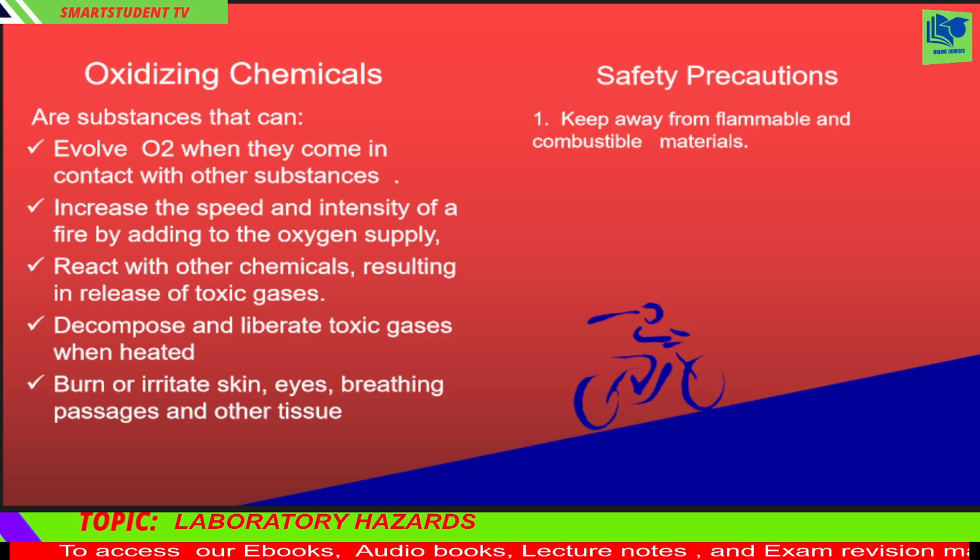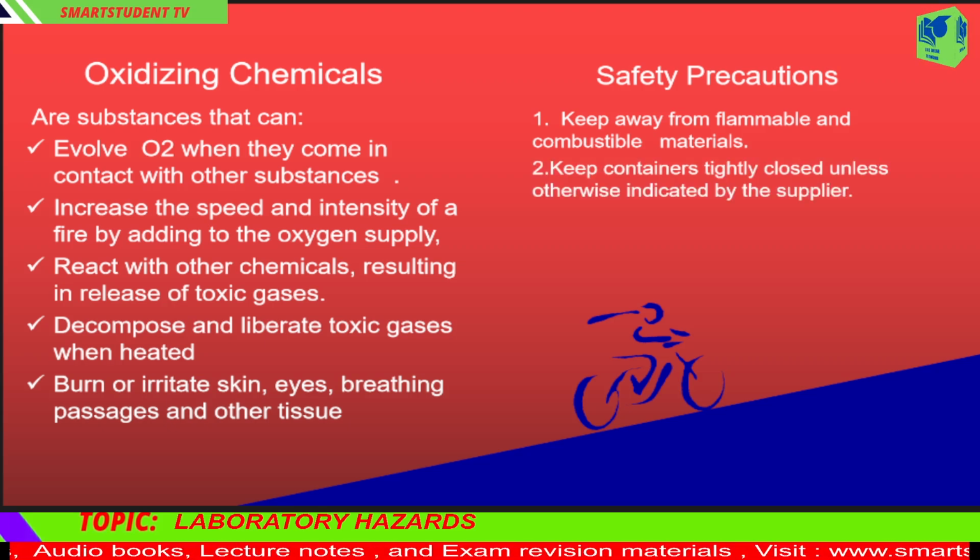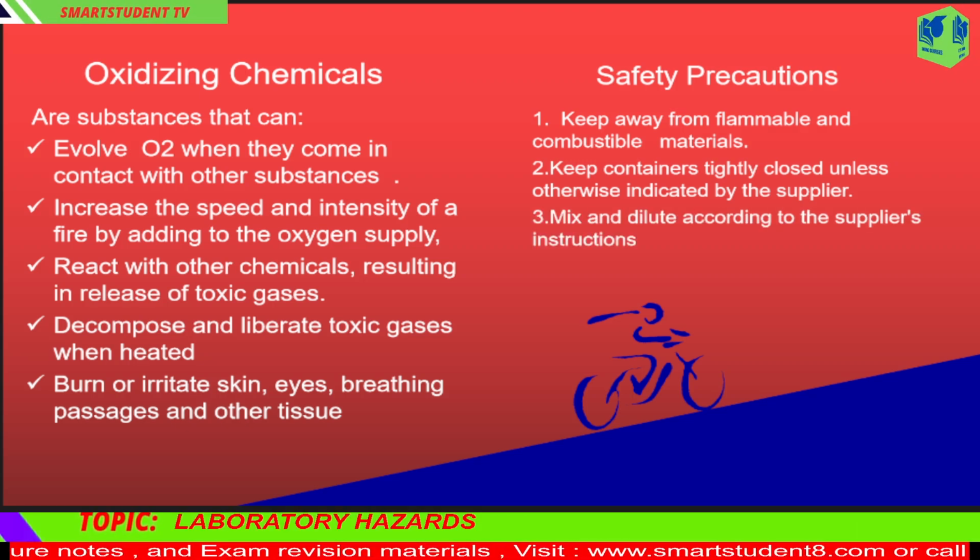Precautions when using and storing oxidizers include: 1. Keep away from flammable and combustible materials. 2. Keep containers tightly closed unless otherwise indicated by the supplier. 3. Mix and dilute according to the supplier's instructions.